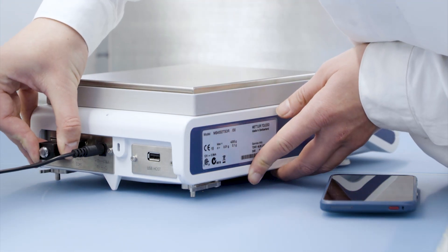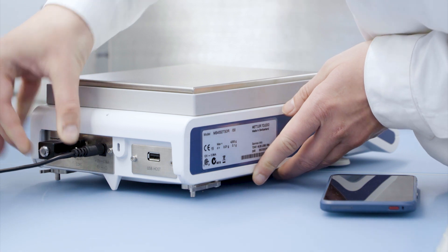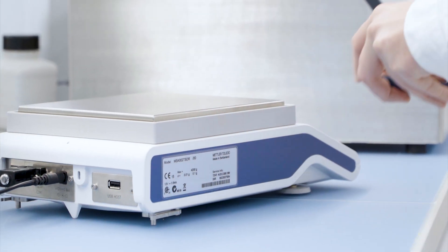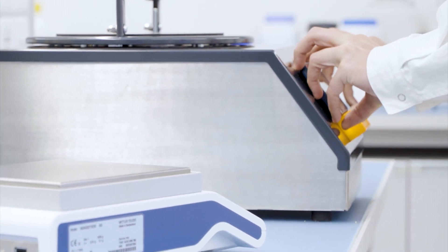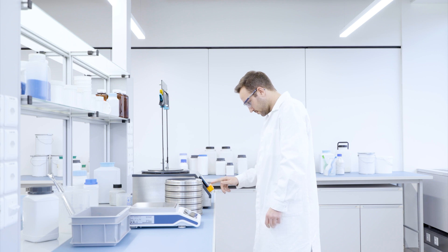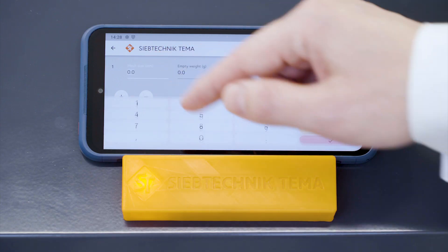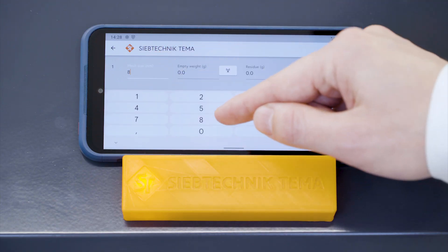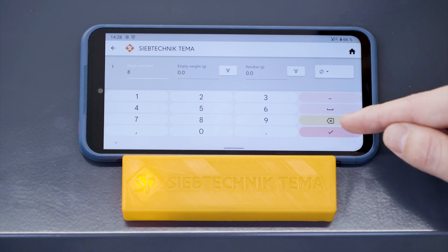Just connect the scale and quickly weigh the empty sieves. Thanks to LabCo, you don't have to re-enter sieve IDs, and the weight is transferred with just one click.